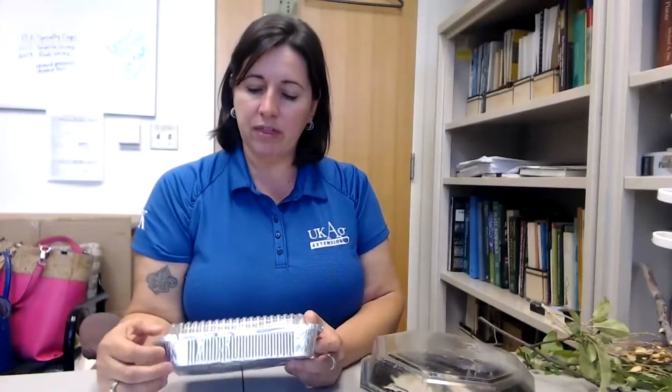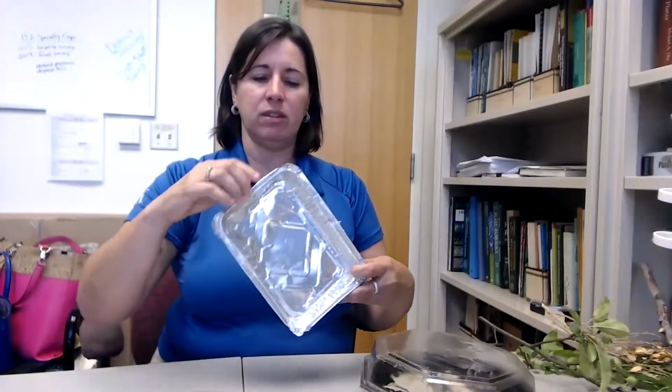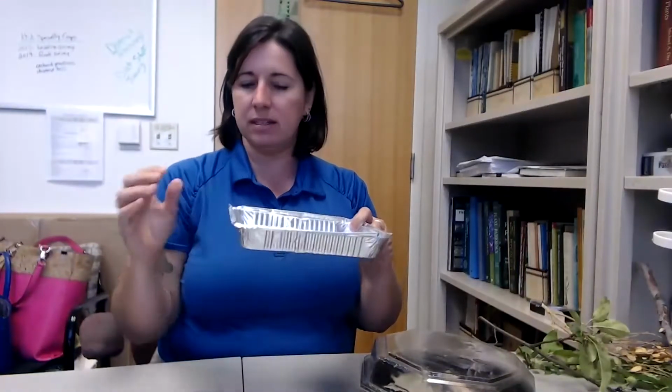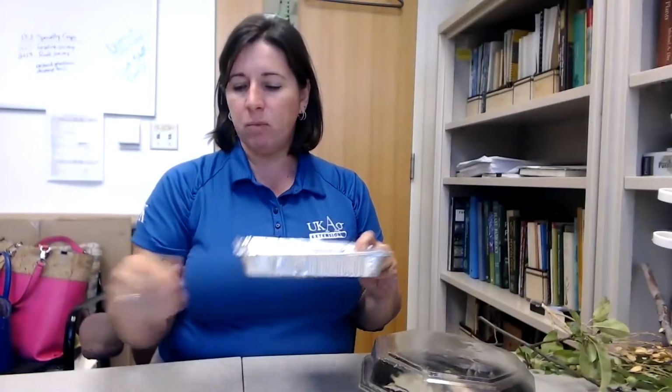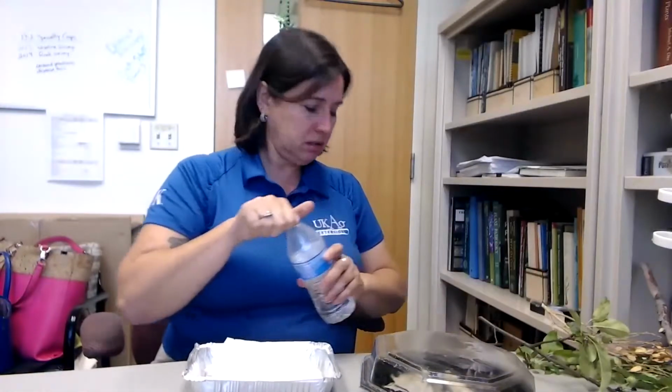This is one thing that's always a lot of fun as well. If you've ever taken a plant disease diagnostics class, you've done this. I'm going to use this little foil container, and I save these. They come out, go through my dishwasher, and then make it to my office. So what I do is I come in with a paper towel. This one is just left over. You line the bottom with a paper towel, and then you put water. I'm going to make a mess here on my desk. You put water to wet the paper towel.